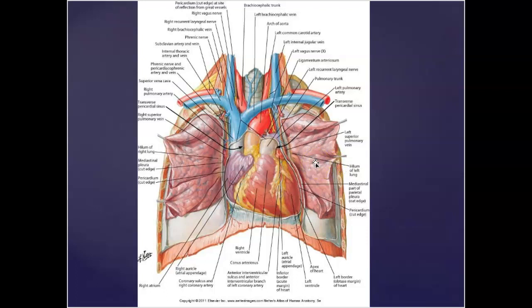Next, you'll find the superior vena cava entering the right atrium here. And you'll also find the inferior vena cava. You'll see this if you lift up this bottom margin of the heart as it sits on the diaphragm. You'll see the inferior vena cava punching right through the diaphragm and entering almost immediately into the right atrium. So you'll be able to see that. And you'll need to cut both of these vessels here and underneath. Maybe a better shot if I show you this one.